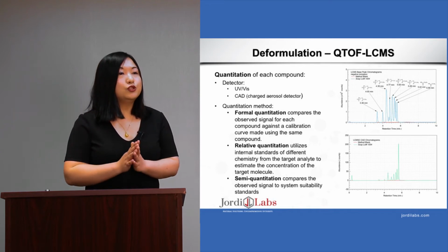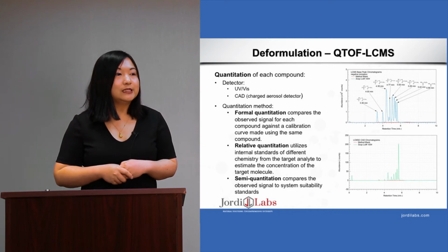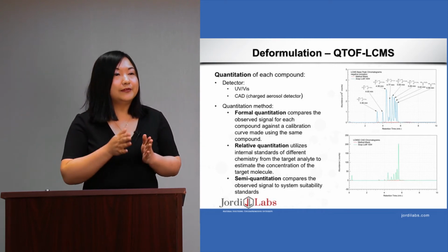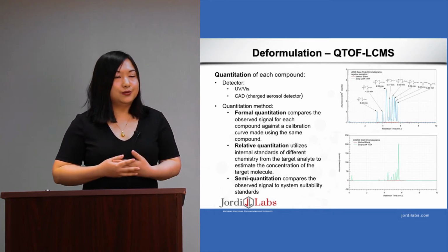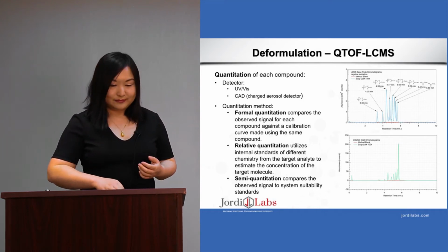So what we do here, as showed in the slide, is integrate the peak area of each unique compound, compare the peak area with the standards we used, and then give a quantitation value.